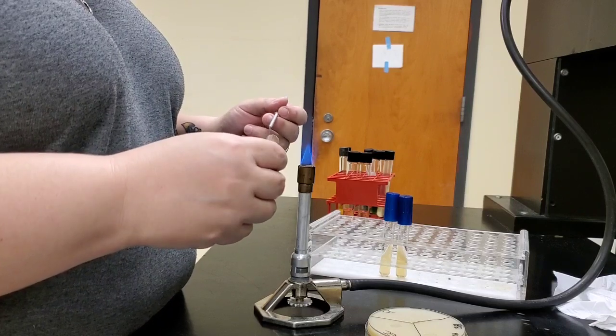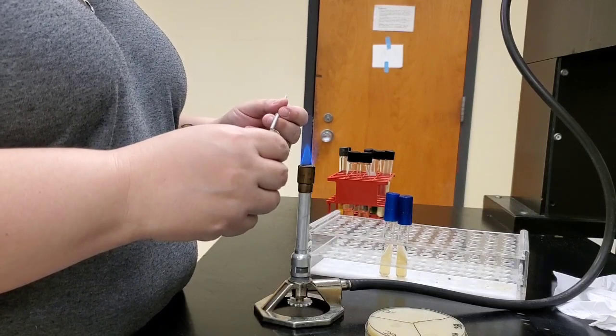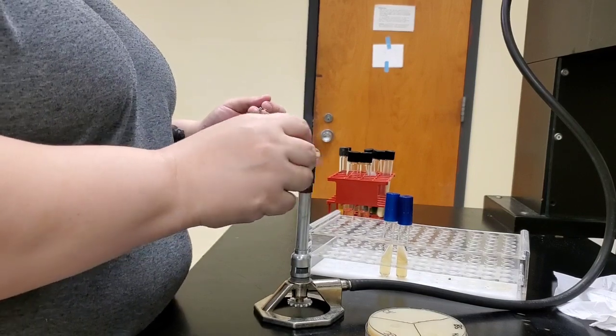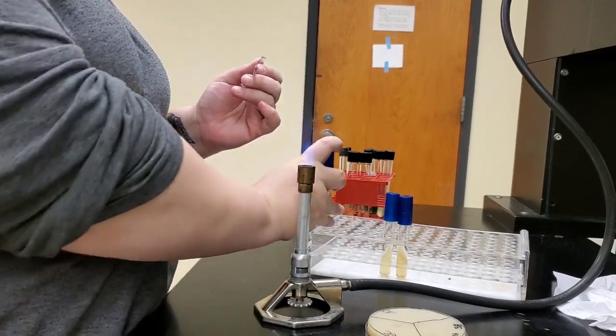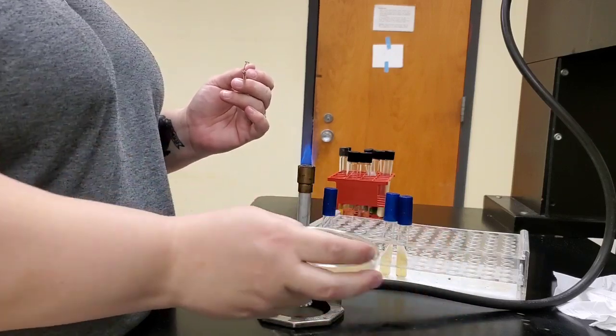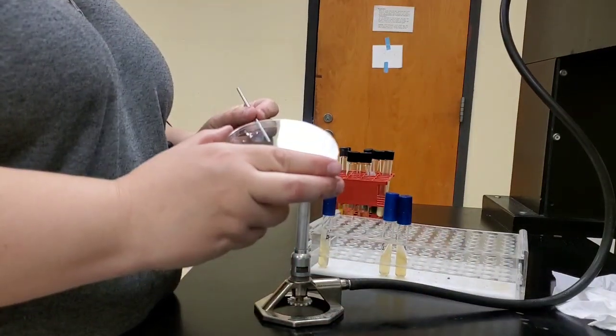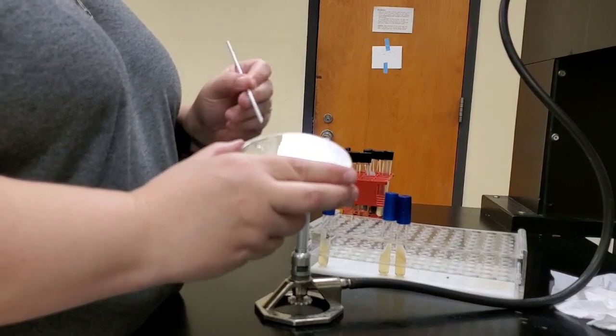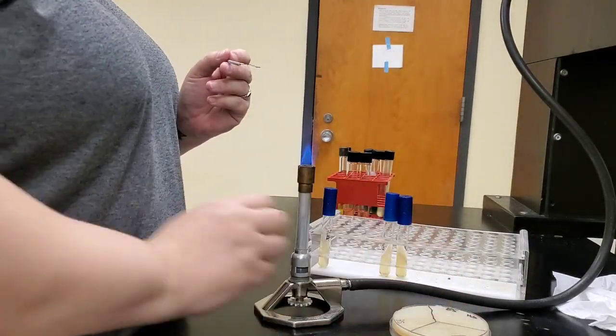So we're going to withdraw some Bacillus subtilis on our inoculating loop and inoculate the sector labeled BS on our milk plate.